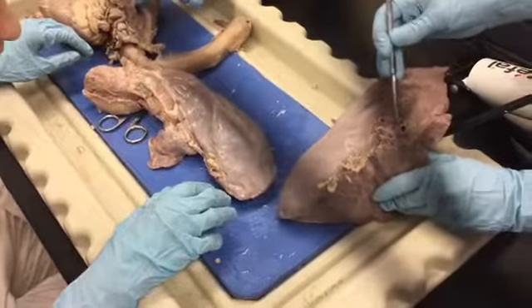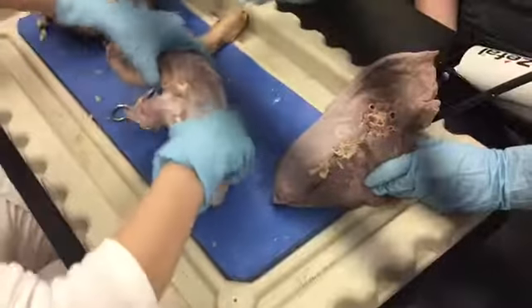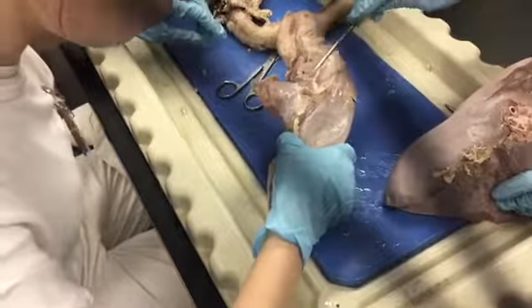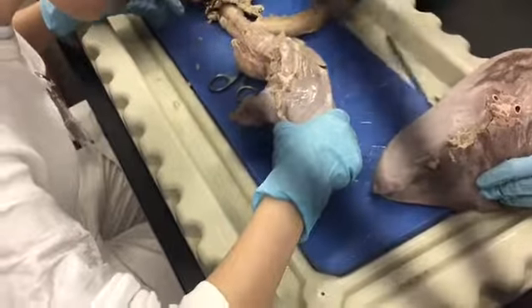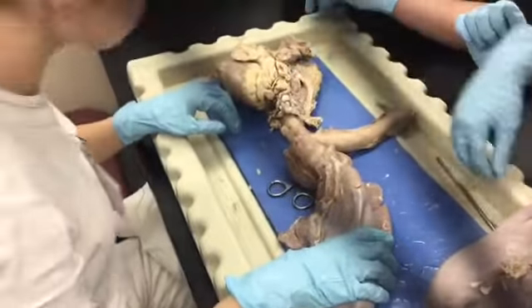Okay. Arteries stay open. Artery right there. These are veins up here. So is this an artery? That's a vein. This, yep, that's an artery. Okay. So what's this? That is a vein. I'm not sure. Okay. Yeah, it collapses. Is this an artery or a vein? That's an artery. Okay, good. Yep, and that's a vein right there.